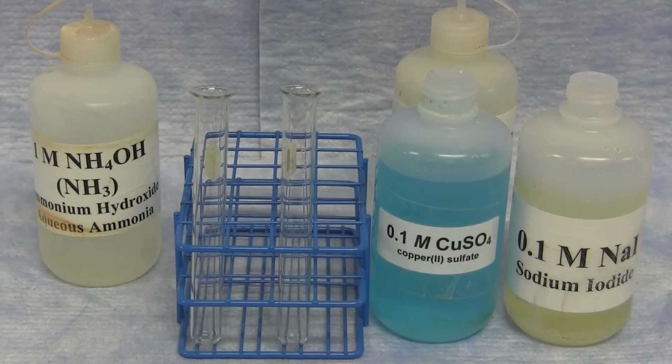In the first part of the experiment, you're mixing chemicals together in specific quantities. You're going to be looking on the supplementary information at what different experiments you're going to be performing in small test tubes. By doing these experiments and mixing these chemicals together, you're going to get a sense of what different types of observations indicate that a chemical reaction happens.